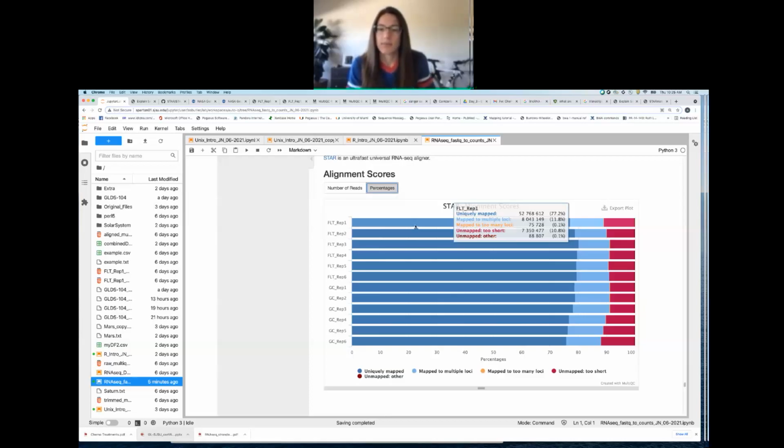It's around 70% mapped considered passable? Yeah, so Ivana, if it's a well annotated genome, yes.